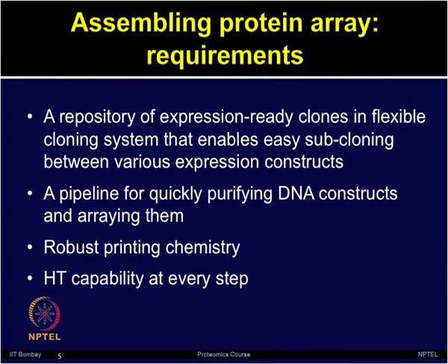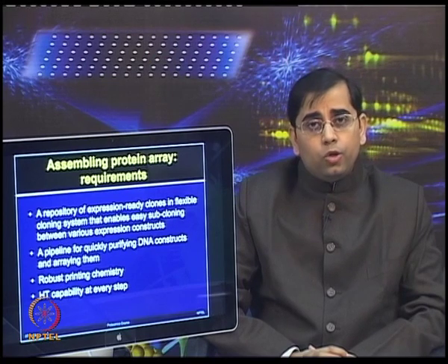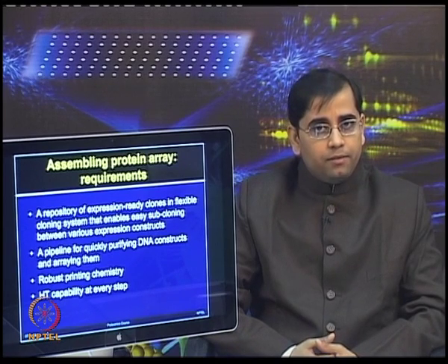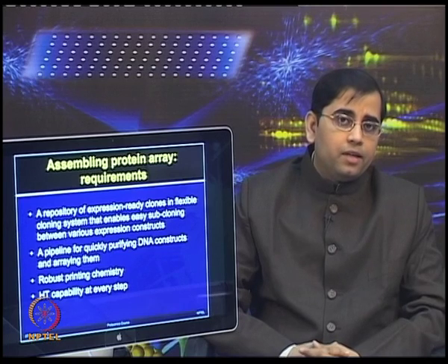So, first of all, we need a repository of expression ready clones, which should be in a flexible cloning system. We have talked in the previous lecture about recombinational cloning, which provides very high quality master clones. Now, those master clones can be easily transferred by subcloning into different types of expression systems. So, if you have different vectors, you can transfer from those master clones.